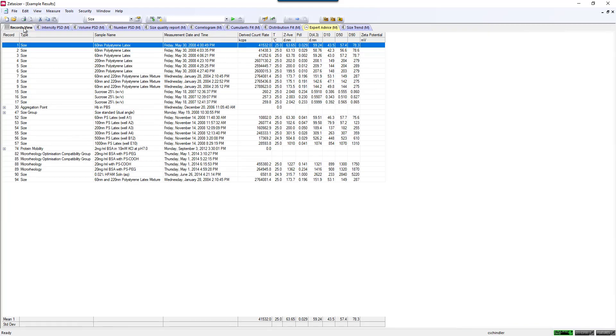Another way of doing this exporting, I can do it in a batch mode. Before I can do that, I have to have some sort of exporting template that tells the software what information do I need to grab from all the files that you're asking me to export.